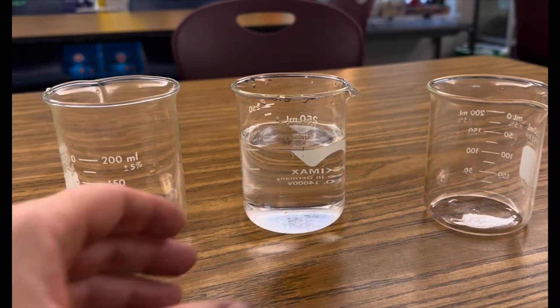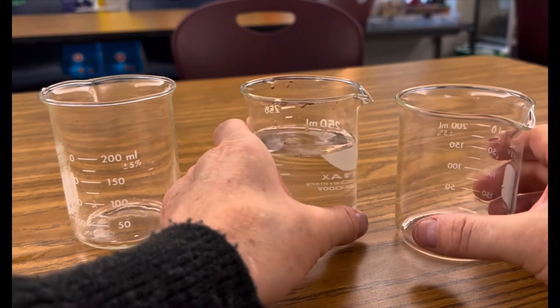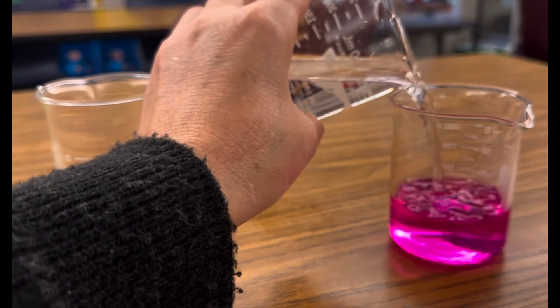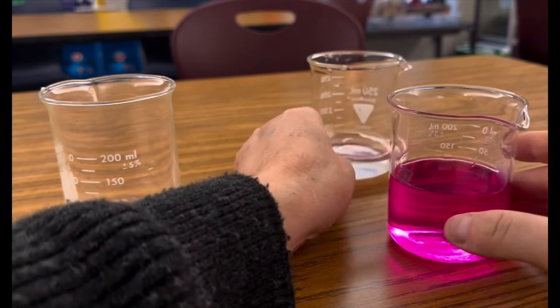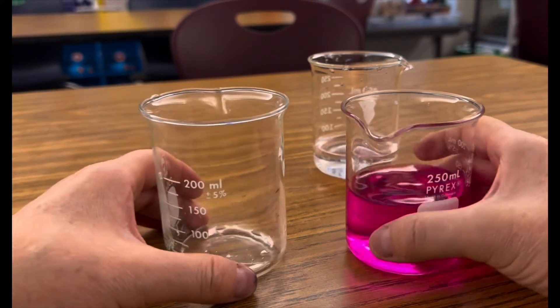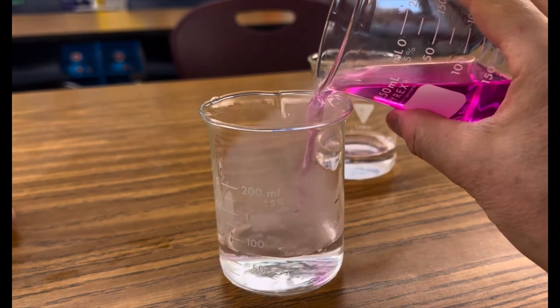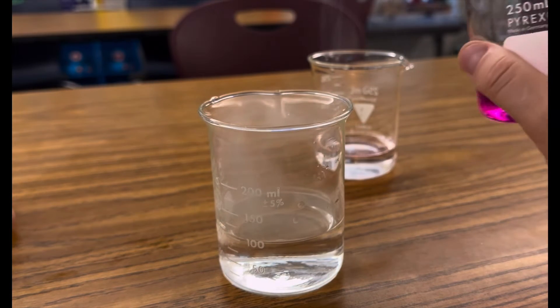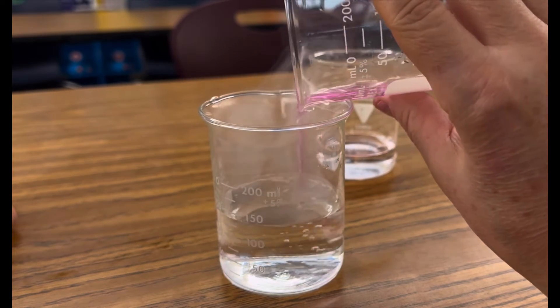Now take your beaker of water that has a few drops of phenolphthalein and add it to the beaker that has the ammonium hydroxide coating the walls — you'll see it turn color, because phenolphthalein changes its color in the presence of a base. It's clear in water or anything acidic. Then pour that colored liquid into the beaker coated with hydrochloric acid, and you'll observe a neutralization reaction where the hydrochloric acid neutralizes the ammonium hydroxide. This is also a double displacement reaction as it turns clear again.